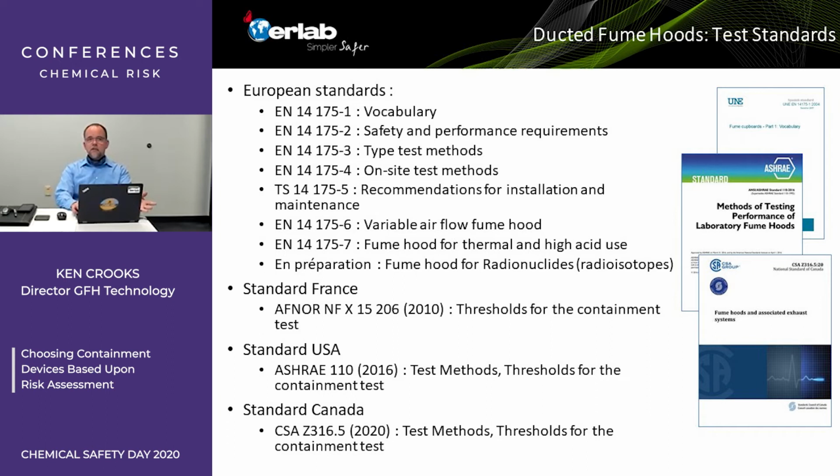And in the United States, we have similar. We have ASHRAE 110, which is the test method and the thresholds for containment tests, whether it's at the manufacturer, as installed, or as used. So there's different thresholds based on the test being conducted.